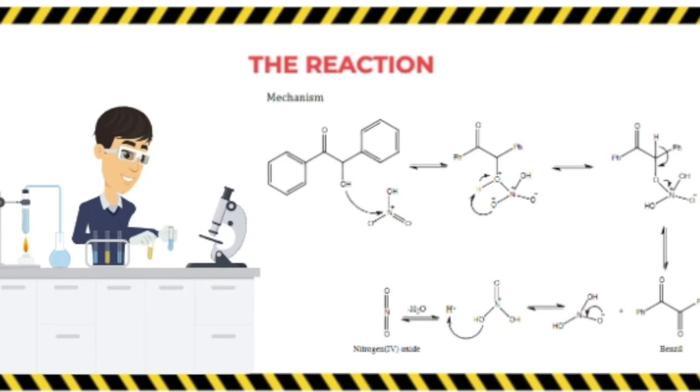I'm not going to go through the entire procedure because we don't have that much time for it. However, I am going to say the condensing of benzoin needs to be done with precise measuring of the pH range, because we need it to be between pH 8 and 9. If it is under a pH of 8, the reaction will proceed at an extremely slow rate, which is undesirable.